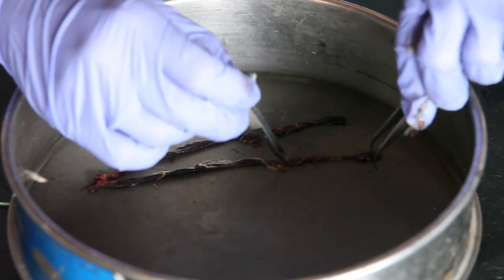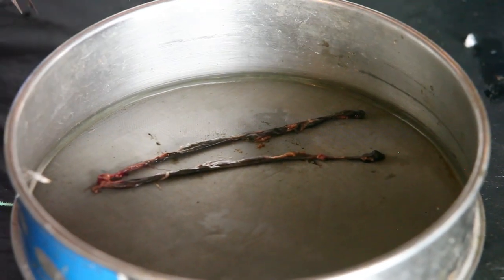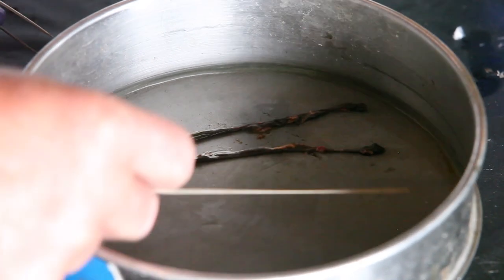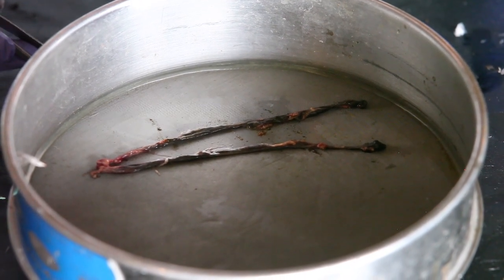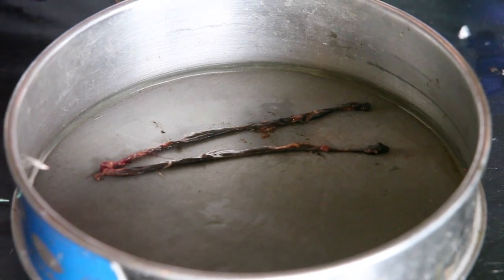So we've got it separated. We've got our two ends, two sides of the ceca. And that ceca is probably roughly 5 inches long, about. And again, you would have never thought that, being coiled up inside the body cavity like that. Okay, so now what are we going to do?